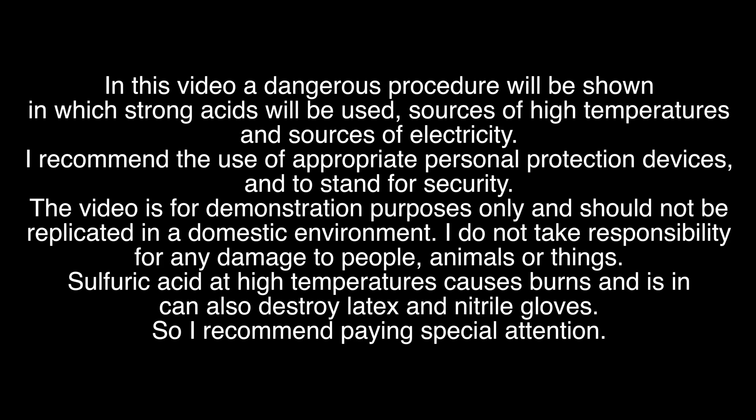In this video a dangerous procedure will be shown in which strong acid will be used, sources of high temperatures and sources of electricity. I recommend the use of appropriate personal protection devices and stand for security.